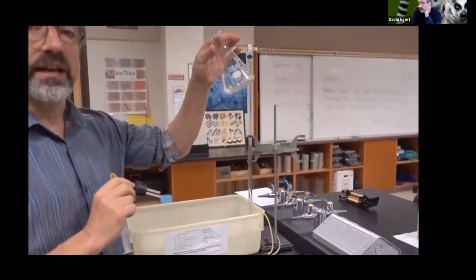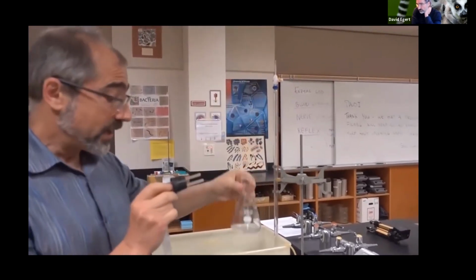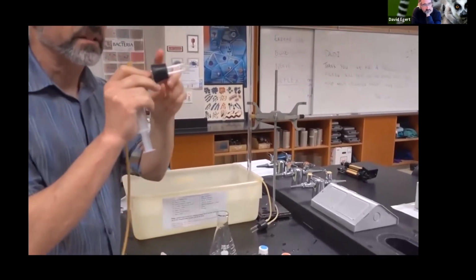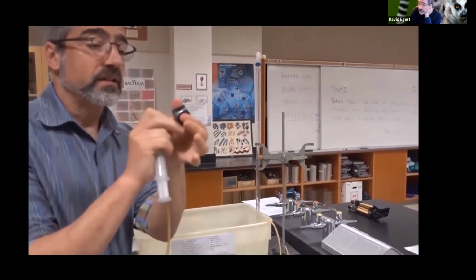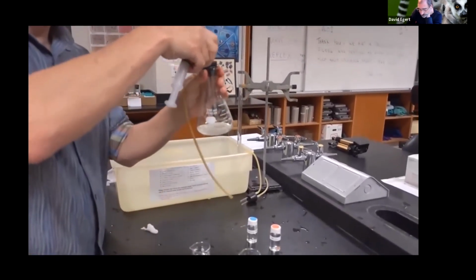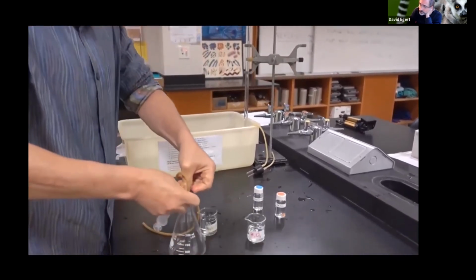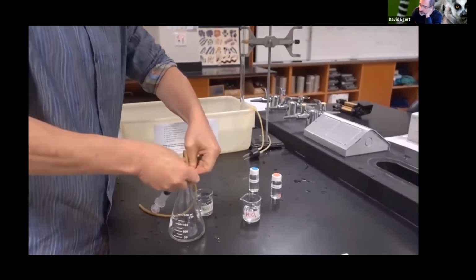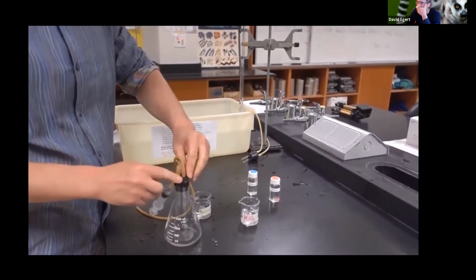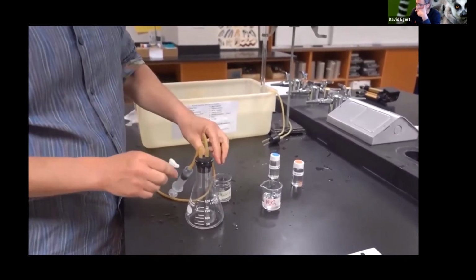Here we have our 10 mils of the enzyme solution, which is constant from trial to trial. I also want to make sure I have a really good seal between my rubber stopper and the flask. So I'll use some water on the stopper before I put it in. Then I can put the stopper in and really seat it very, very firmly. Obviously, don't push so hard that you're going to break anything, but you really want to have it firmly in there. And even though it's pretty darn low, you will be able to rock it and get it out when you're done to do the next trial.